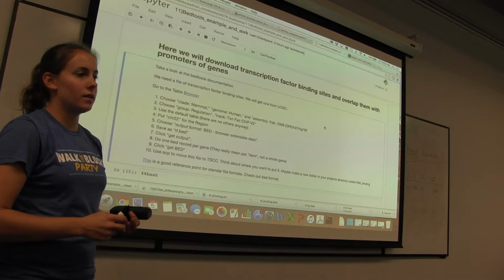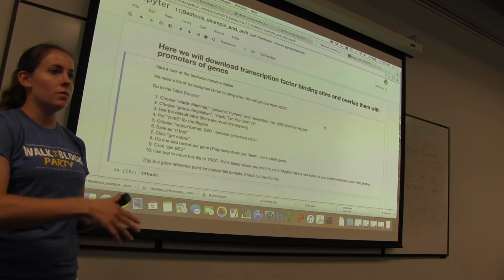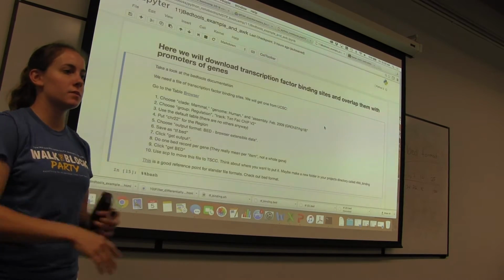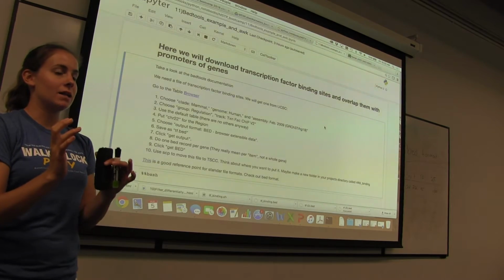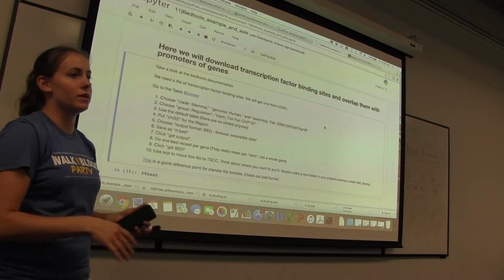Yeah, that's more the specific details of a ChIP-seq or a CLIP-seq data set, where you're getting these pile-ups of reads, and that's when people use peak calling algorithms. There's a whole field on this to identify those regions that have really big, high pile-ups of peaks, to identify that it's actually a binding site, because you get a ton of noise in these data sets.